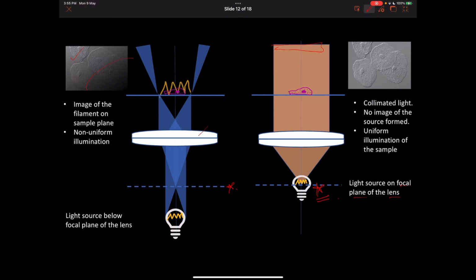Now the image you see here is perfectly illuminated because the illuminating part is also aligned with respect to the imaging part. However, in this case, you can only see that the condenser lens, light source and the specimen plane, all these parts contribute to the illumination part of the microscope. However, a very important part of getting Kohler illumination is to align the illuminating part with the imaging components of the microscope.